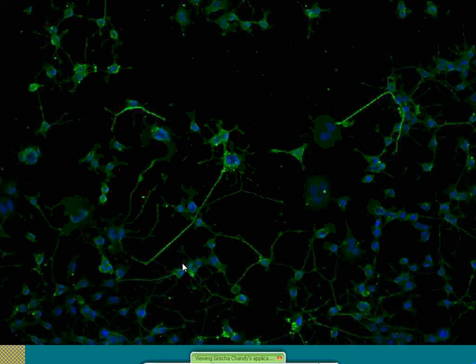In addition, slightly tangent to that, we are doing some projects moving towards a model of doing co-cultures, for example, with iPS-derived hepatocytes with iPS-derived Kupffer cells or macrophages to try to better model the in vivo environment that might be contributing to drug-induced liver injury.